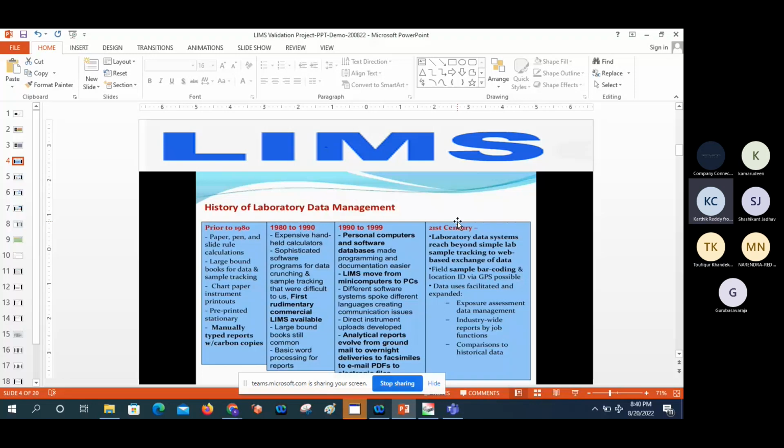So we can cover all the scenarios. Master data creation is playing a major role now. Majority of the people are being recruited by organizations, like software and consulting organizations as well as pharmaceutical organizations, for LIMS master data and for the supporting team, like administration activities, and how we perform as a LIMS administrator.